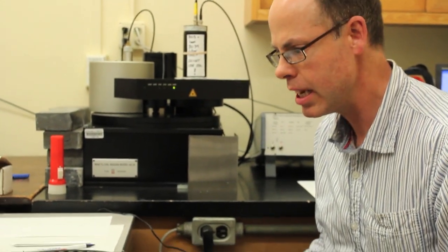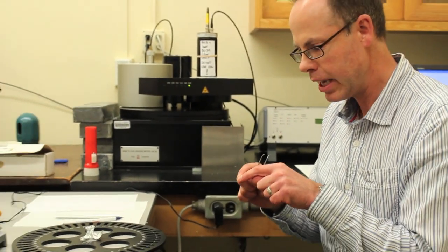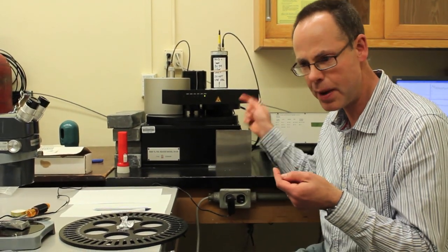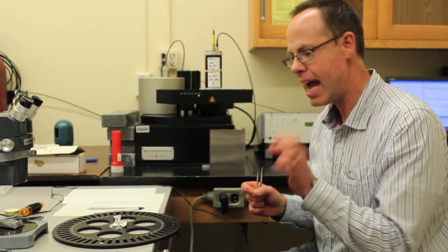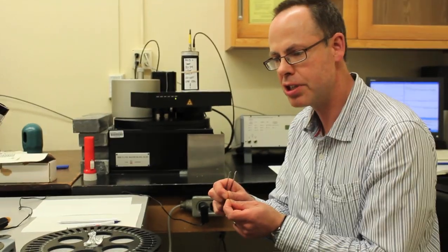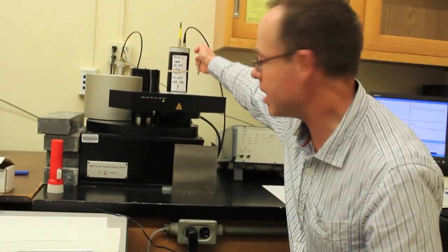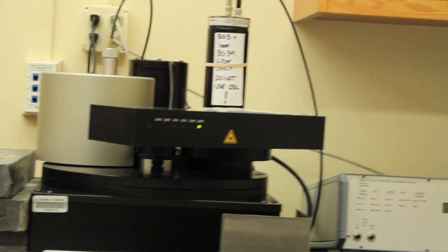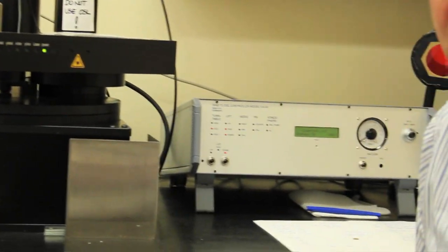The light that we're shining on the sample is infrared light. It's stimulating electrons to become untrapped. They're actually grains of feldspar that are in the machine at the moment, and they're recombining within the grain itself to produce a blue and ultraviolet signal that we're collecting. We collect it in this very sensitive light detector, and this is passed through to the electronics, and that passes the signal through to the computer where it's stored.